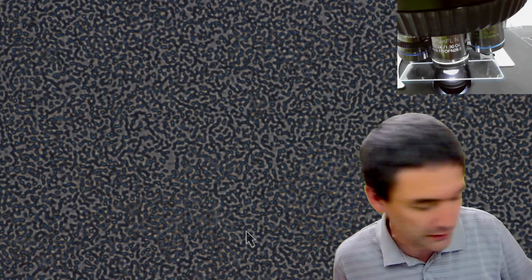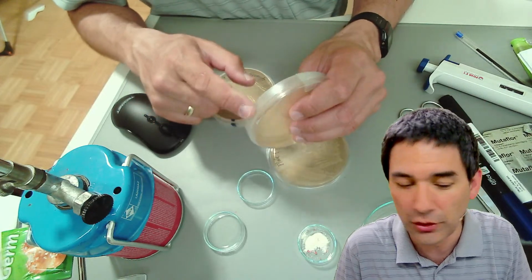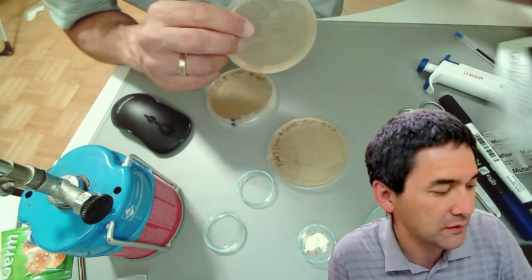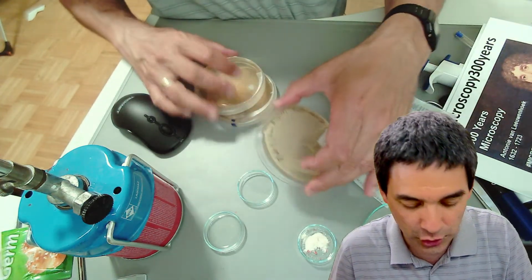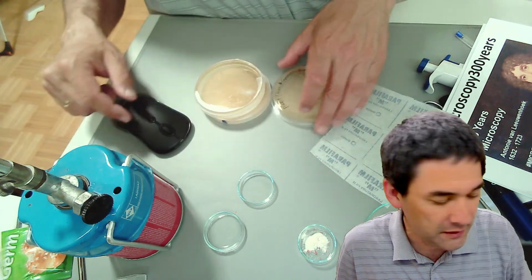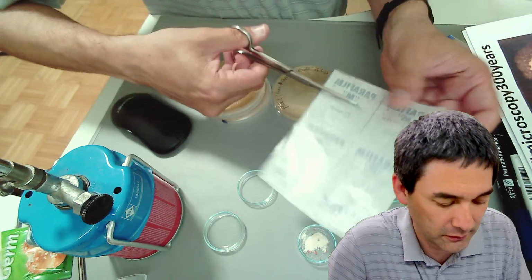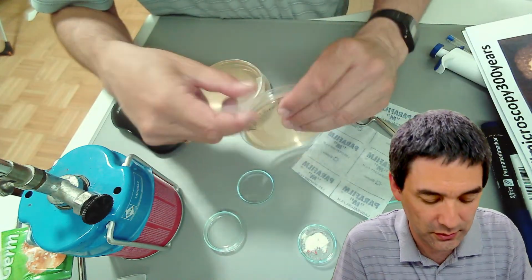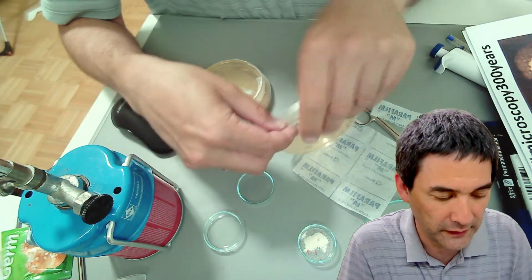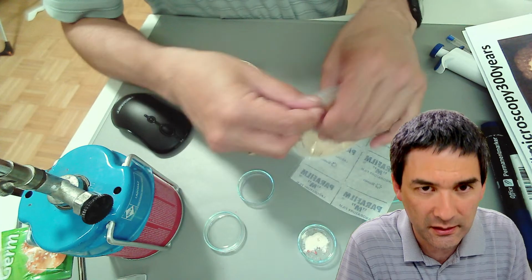Parafilm, yeah, parafilm is where did I put it again? It's the thing that I use to cover the Petri dishes. It's called parafilm. Here it is. It comes in a big roll, and I'll show you again. I'm just also going to cover this plate again. So you do the following. You cut off a little strip of parafilm. Yeah, and you basically close it off like this. You have to stretch it and then it becomes sticky.